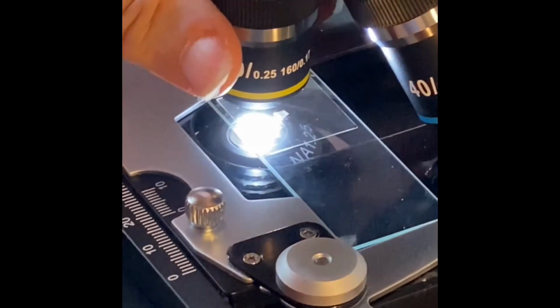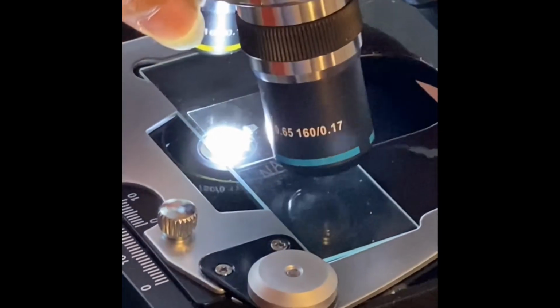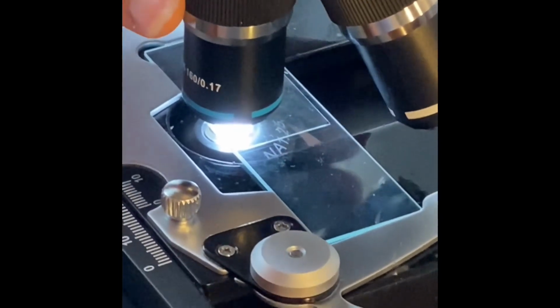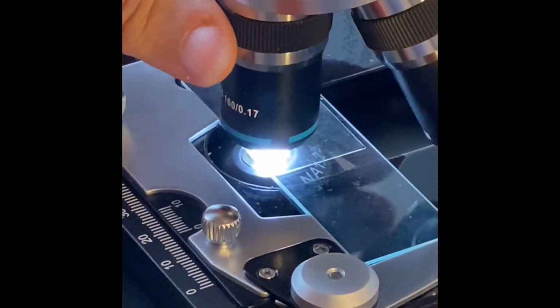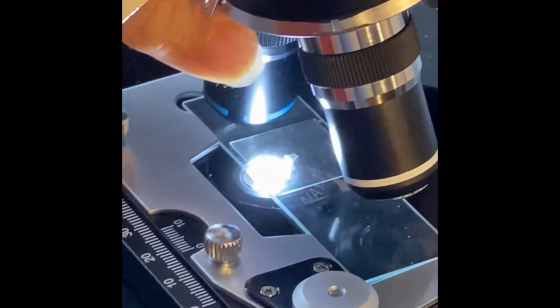That means 10 times as large as the image. And then if you have a third one, it would be 40x, and that would be 40 times the magnification.